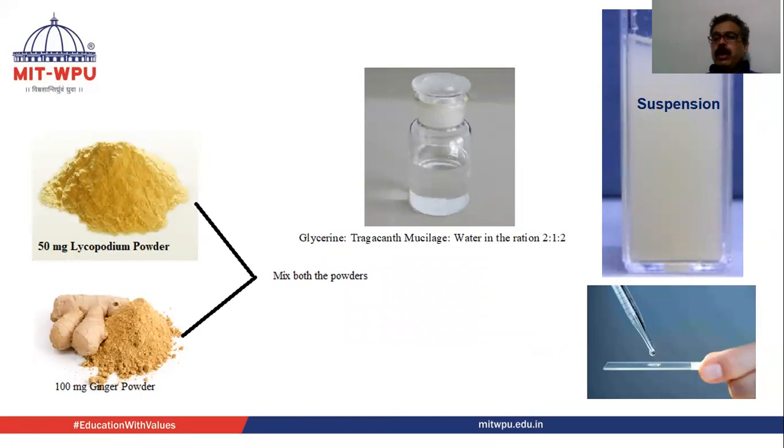Here we have taken the paste which we prepared in the watch glass into a test tube, and then added the suspending agent. We have to shake it properly so that no air bubble remains in the test tube. It should be completely mixed. Then we take a drop and check whether the dilution is uniform and correct. If we can see 10 to 20 spores, then the dilution is okay. Otherwise, we need to add more suspending agent.